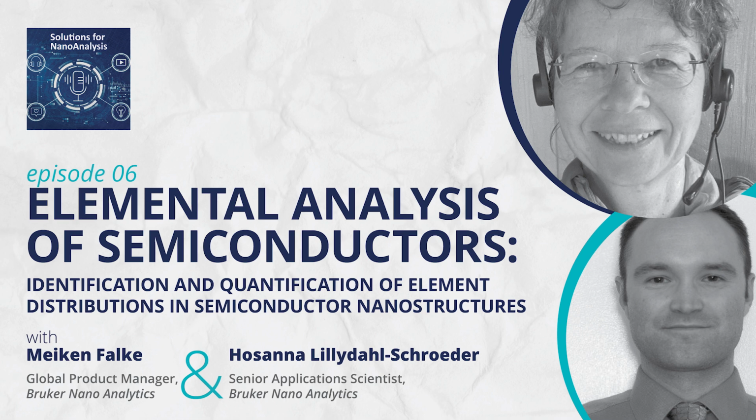In EELS, however, the complete energy loss of the electron is analyzed. So that means the electron loses energy for many different processes, and only one of these processes is the emission of characteristic X-rays, which EDS looks at. EELS has hidden within itself a much more complicated collection of effects, which we can see in the EELS background. So the background at a particular energy represents the overlap of all energy losses below this energy edge.